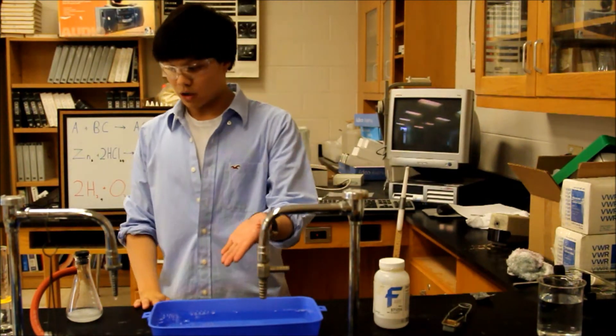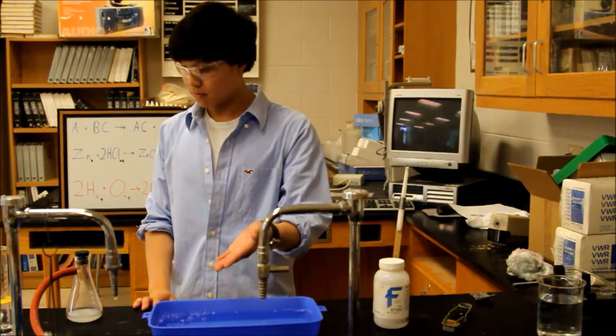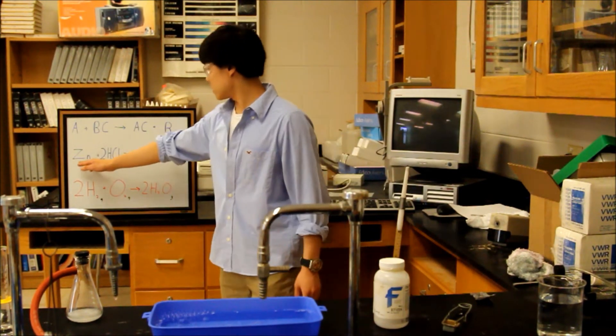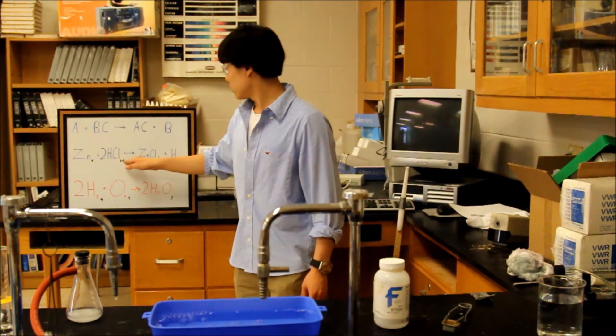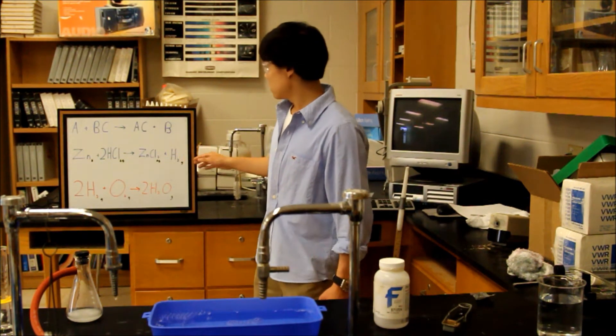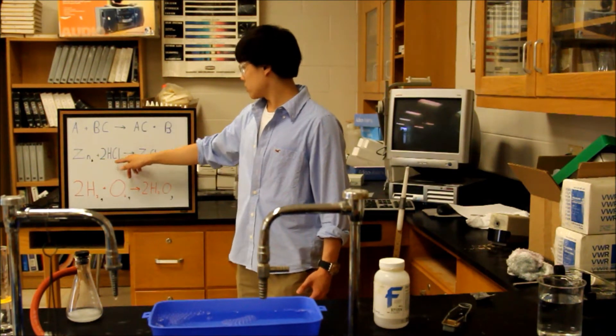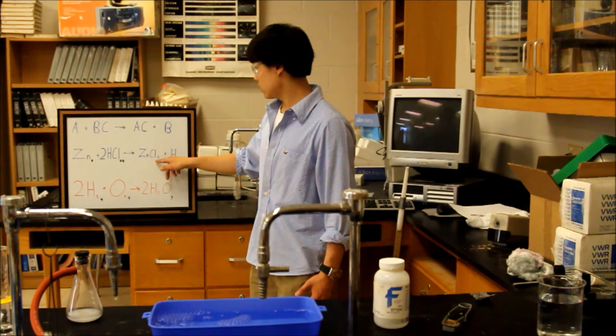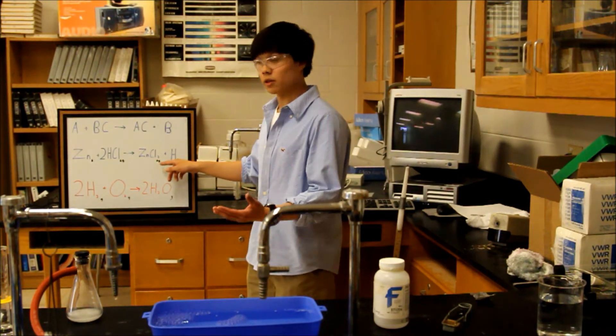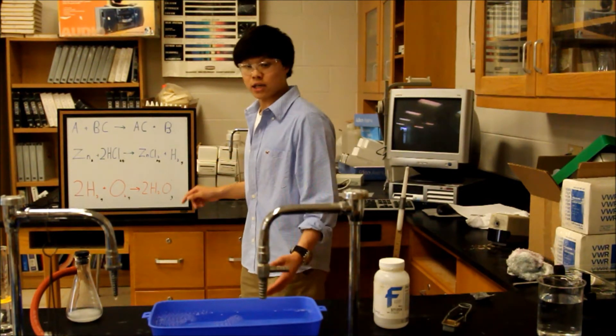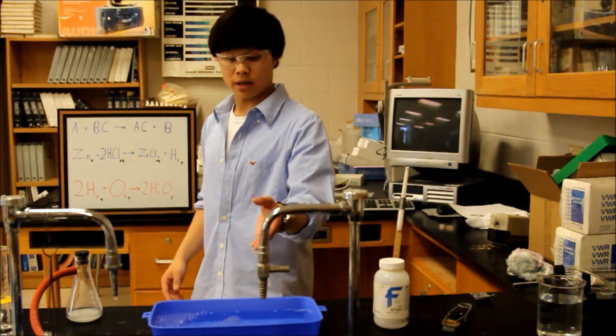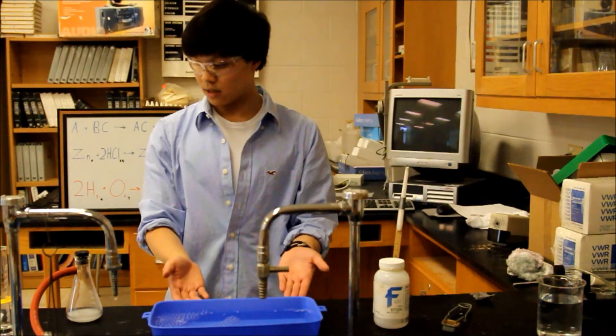As you can see, bubbles are produced in this reaction. The reaction that's proceeding is zinc plus 2HCl yields zinc chloride and hydrogen gas. Solid zinc and aqueous HCl produces aqueous zinc chloride, because of the solubility rules, as well as hydrogen gas, which is being bubbled through into this gas collection trough.